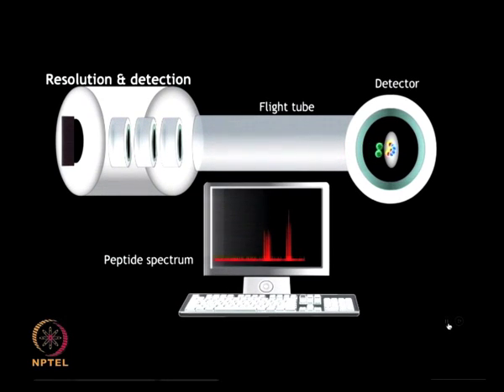Parameters such as geometric design, power supply quality, calibration method, sample morphology, ion beam velocity, etc. All of these factors affect the accuracy of mass detection.